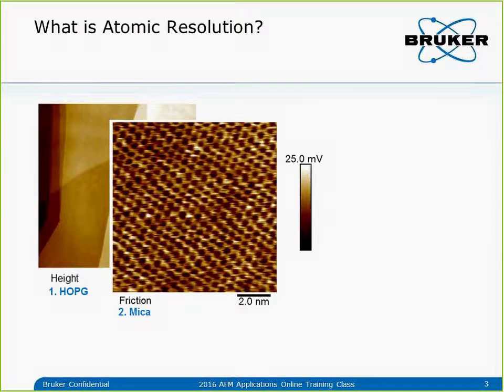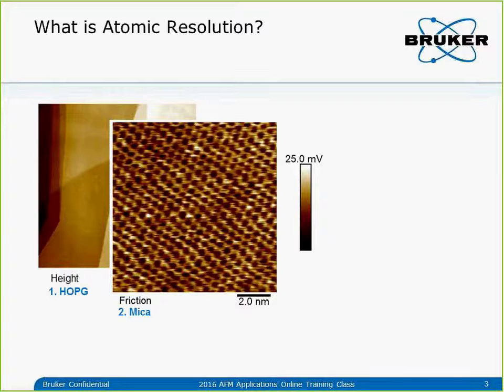This is mica imaged in contact mode, and we can see the lattice of the mica. The spacing is about five angstroms. I think this qualifies as atomic resolution. Some people believe that for contact mode imaging of mica lattice, we are actually using many atoms on the tip to image many lattice sites on the mica surface simultaneously — which is probably why we cannot see atomic defects using this technique. But it's a nice image. You may notice there's some drift — we'll talk about that in more detail later.